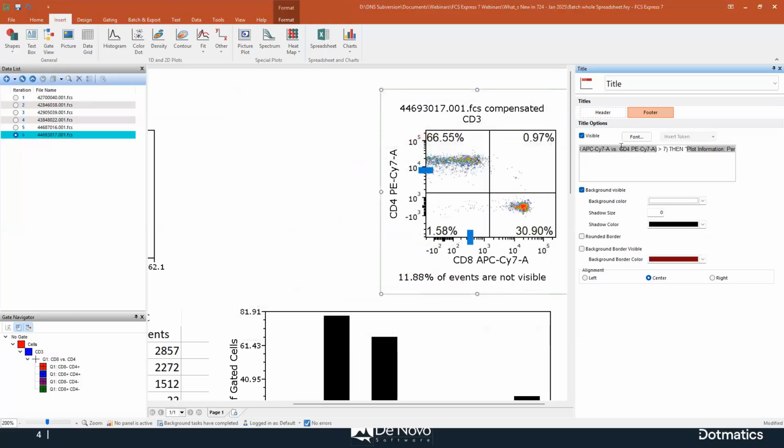Just one trick. You see that the name of this token is usually pretty long. So if you want to make it shorter while customizing this formula, you can simply right-click and show it as a value instead of as a description. So if I do it, you see it will show the value. So it's just like 5 characters instead of a full sentence. And I can do it also here. So it doesn't change anything in the plot itself, but it just changes how you read the sentence. So it might be easier for you.